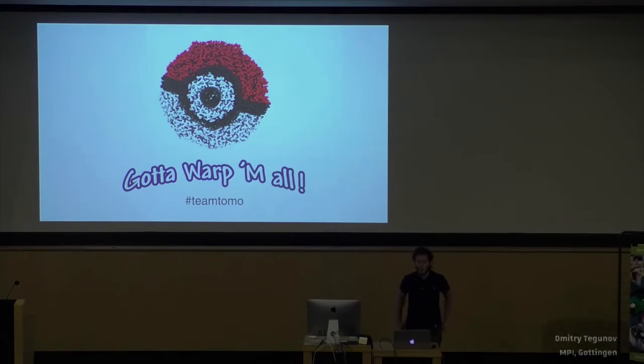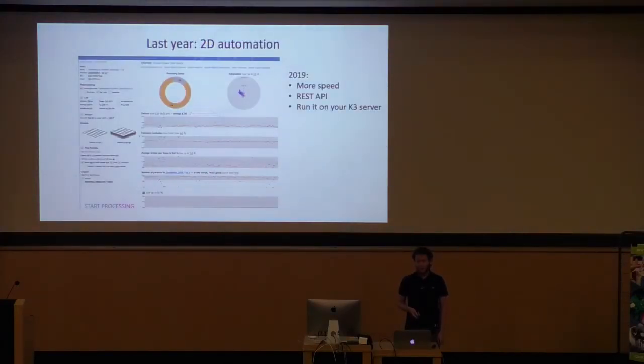Yeah. Good. So, thank you very much for having me here again this year. Last year, at the previous iteration of this workshop, I was presenting the automated 2D pre-processing pipeline in a software package called Warp that I wrote.